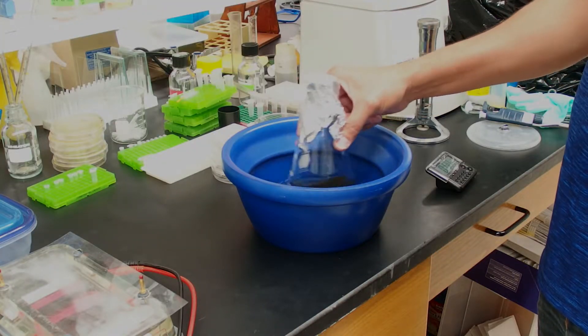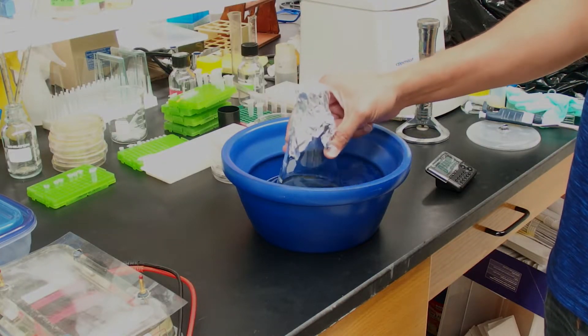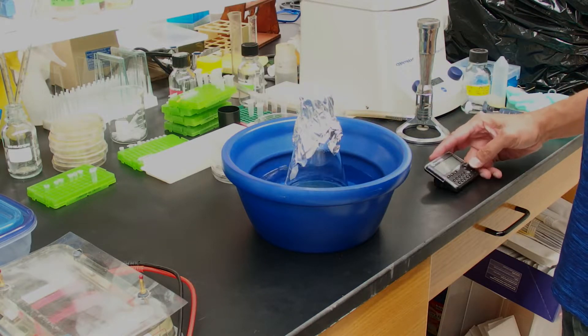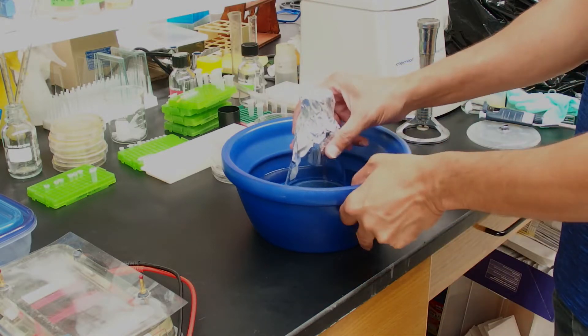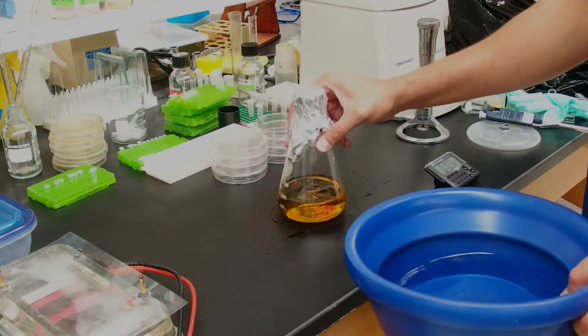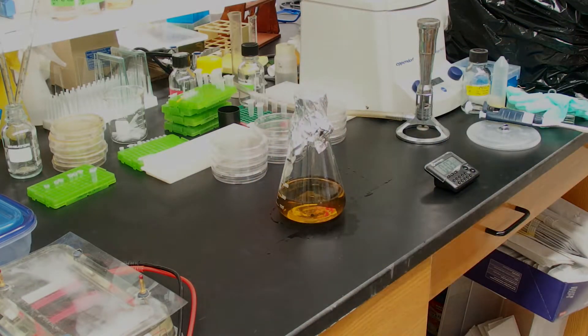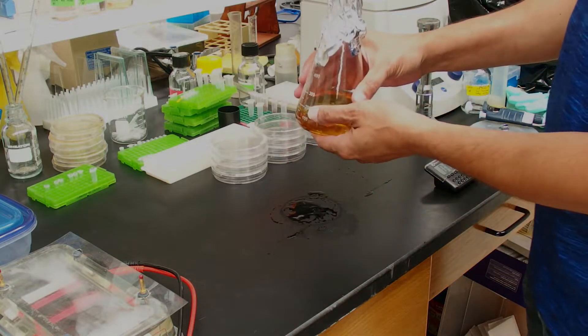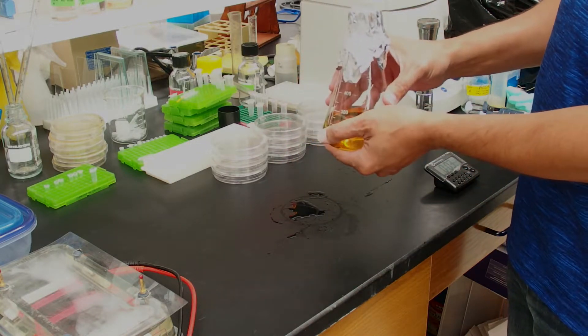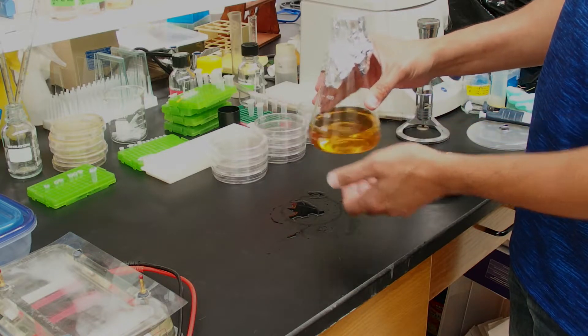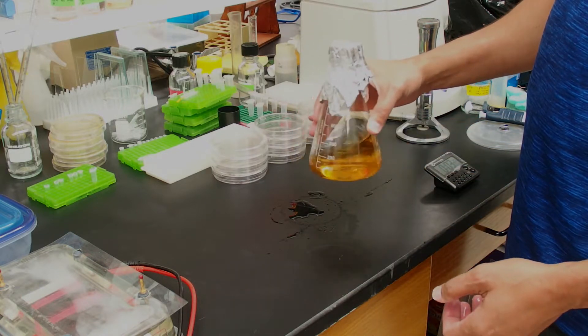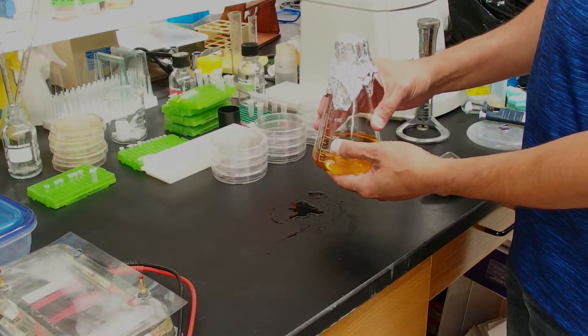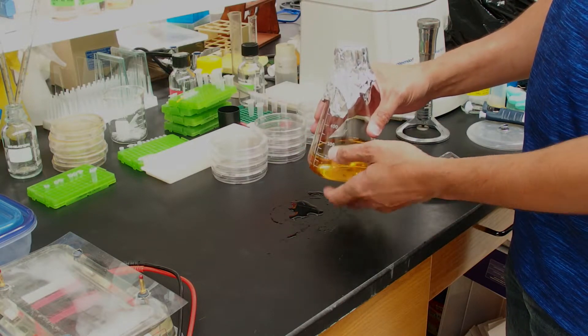You're able to gently swirl your LB agar a couple, two to three times during that three minutes. Our timer is done. At this point, when you feel your LB agar, you should be able to hold it. It should be quite warm so that we don't want it to solidify while it's still in the flask. But it shouldn't be so hot that it burns you.